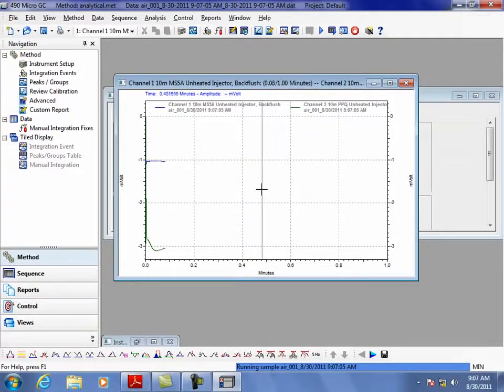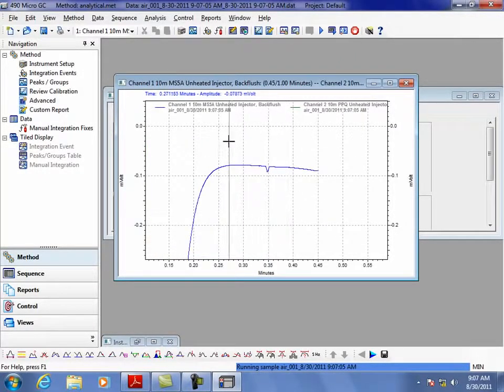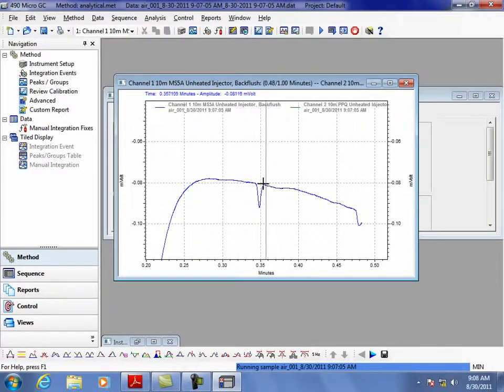And it's putting both of these on one run, on one screen, which I don't like very much. I'll break this up and put them on two separate screens. It's convenient for users, a non-chemist in the sense. Okay, well, you can look at it that way. It's easy. I'll leave it the way you want it. You can blow these up as they're coming off, and you can see that there's my one peak.